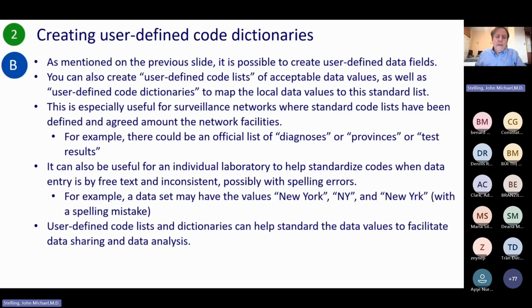The best kind of cleaning is cleaning you only have to do once. I don't like cleaning data in WHONET because every month I'm going to have to clean the data in WHONET again. If I can clean the original source data forever, then I don't have to repeat February, March, April. The data will be clean. Or in BacLink, if it's a code mapping, once the code mappings are correct, New York with an incorrect spelling, it will correct it during BacLink. So when I'm thinking of making edits, I try to make the edit in a way that will last forever, so I don't have to be fixing the files every month.